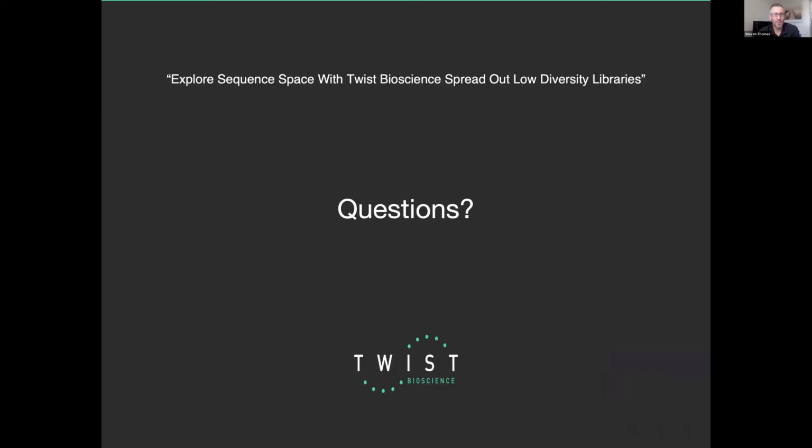Here's another one. What algorithms do you use that speak to bacterial or mammalian codon bias? I'm not sure that I really understand the question about what algorithm we use. I don't understand the speak to it part, but maybe: can customers use a custom codon table? Yes, customers can work with them to codon optimize the sequence and the substitutions that are made.